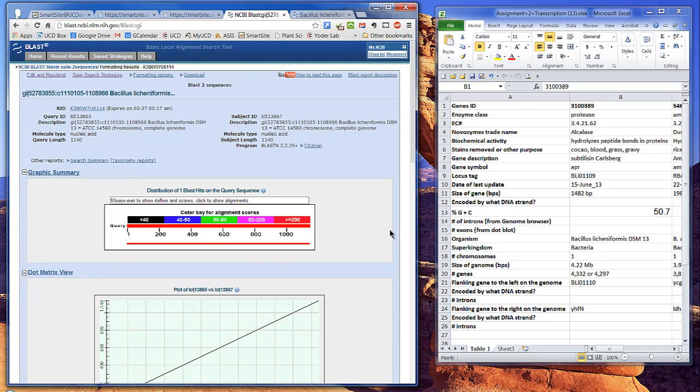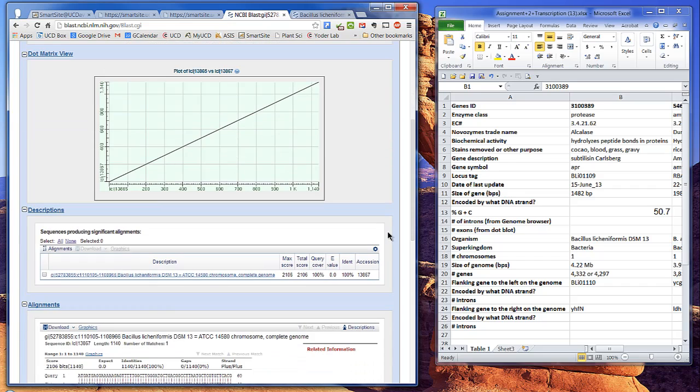Now let's visualize this in the dot matrix view. Gene sequences are along the bottom, RNA is along the side, and a diagonal line draws between because of the identity.